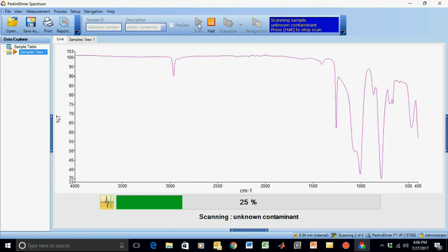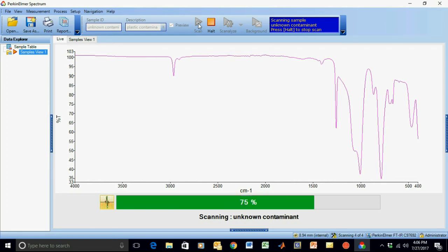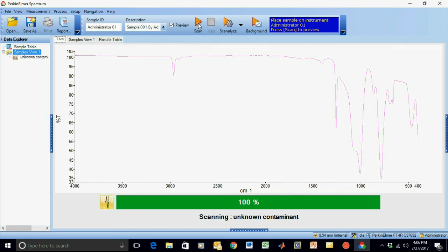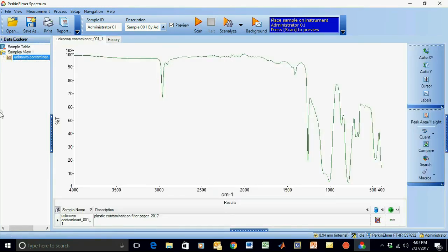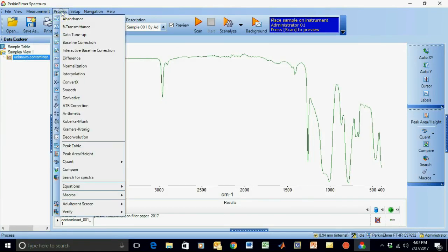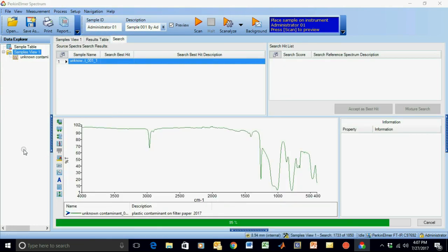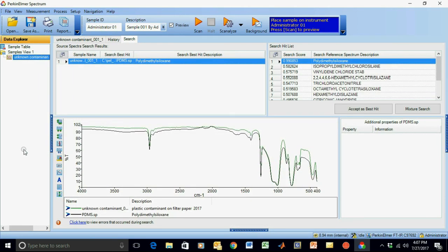Due to Surveyor's optical design and the utilization of an instrument-mounted detector, we're able to access the full spectral range. The material was identified as polydimethylsiloxane, or PDMS, with high confidence through searching spectra of known materials. PDMS is a common septa or gasket material which contaminated the injectable drug.